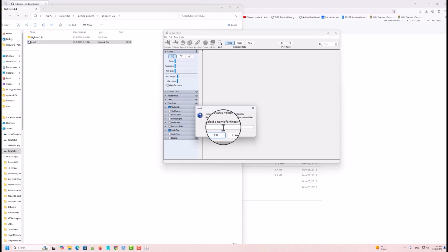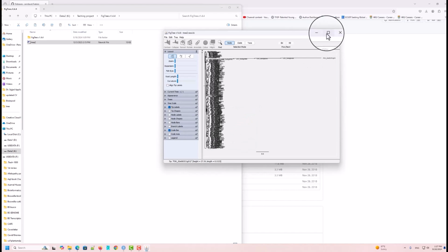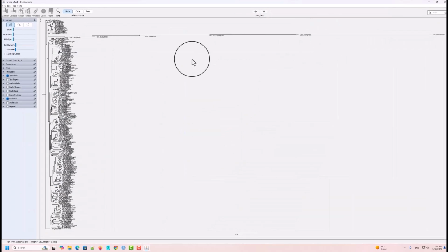So yes, we select okay, since we need all these things here. In this step you should select okay. When you select okay, you will think that it is an unclear phylogenetic tree. So how can we make it publication ready, our publication standard phylogenetic tree? I will show you here how to make it.